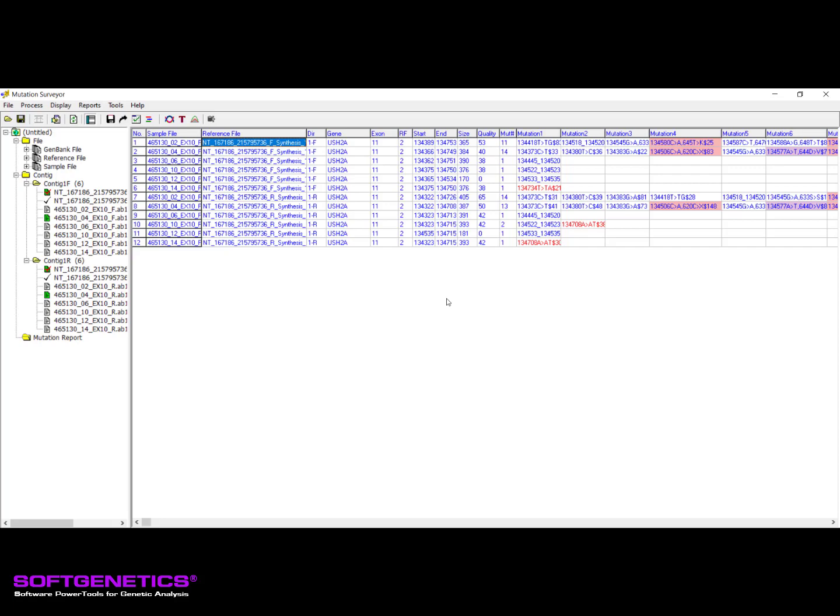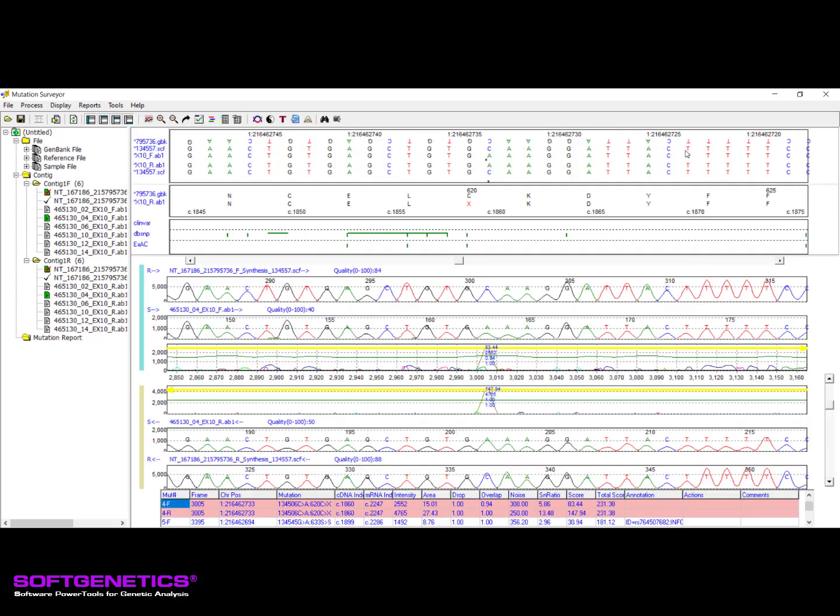The mutation report can be used to navigate to the graphical analysis display, or GAD, for visual inspection of the sample trace files and variant calls. To inspect a trace, double-click on the trace name. To view a specific variant call, double-click the cell that contains that mutation call. This will open the graphical analysis display to the selected location.